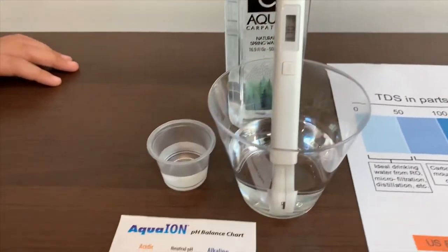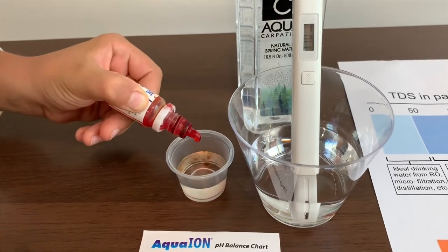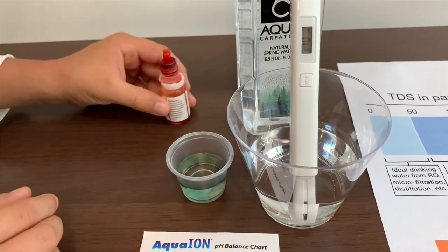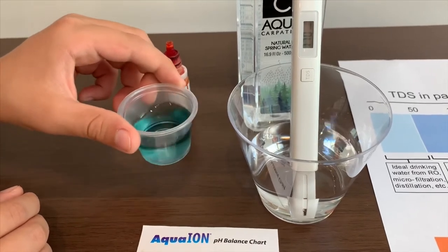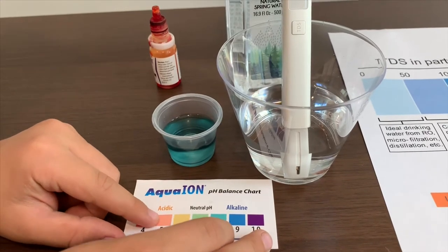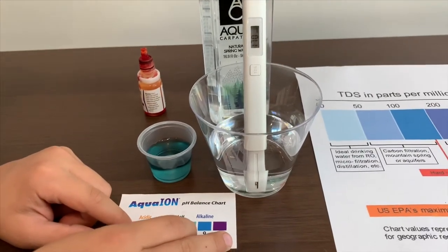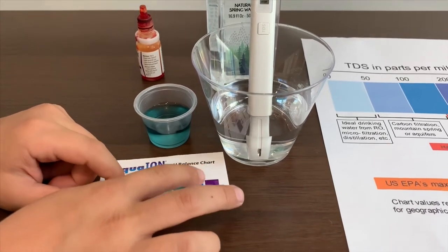Now let's test the pH level. Add only two drops and stir it a little. I would give this an 8 or a little bit higher, which means it is alkaline water.